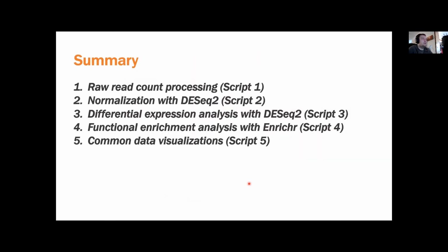And yeah, that basically summarizes the full RNA-seq analysis, starting from the raw read counts. The way that I've set up the tutorial is there are these 5 different scripts that contain different parts of the analysis. This is because when you're actually doing the analysis, I find it helpful to divide it across different scripts. It makes it easy to keep yourself organized, and if you need to go back to redo a particular part of the analysis, it makes it easier to find what you're looking for.